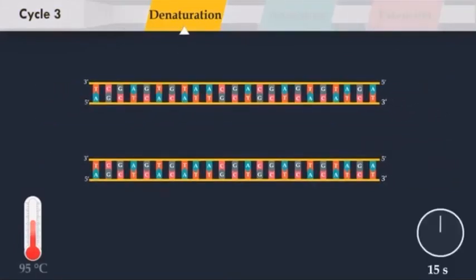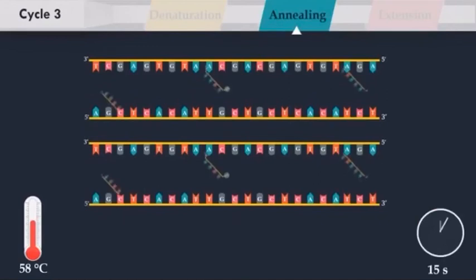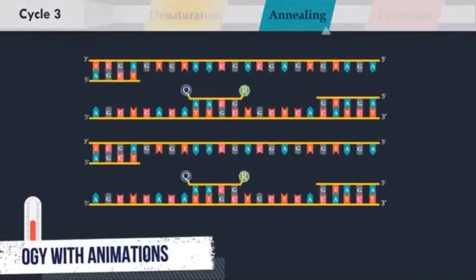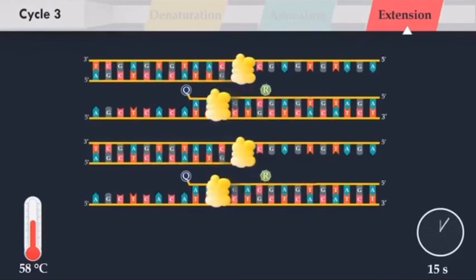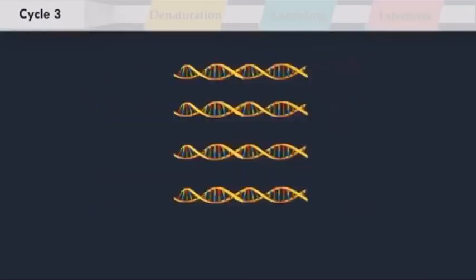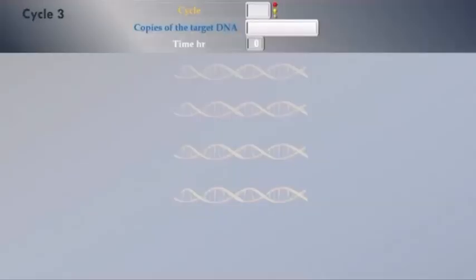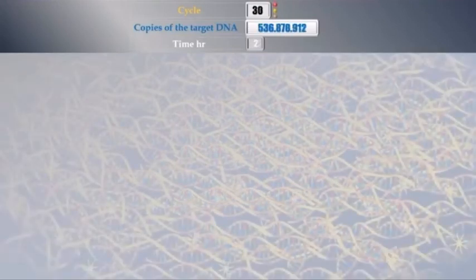With each cycle of PCR, more dye molecules are released, resulting in an increase in fluorescence intensity proportional to the amount of amplicon synthesized. This method allows the estimation of the amount of a given sequence present in a sample. The number of double-stranded DNA pieces is doubled in each cycle, therefore, PCR can be used to analyze extremely small amounts of sample.